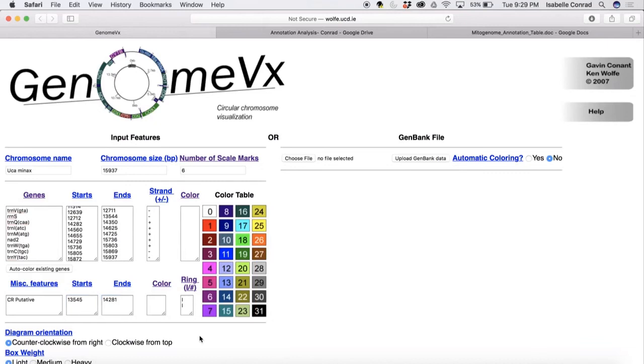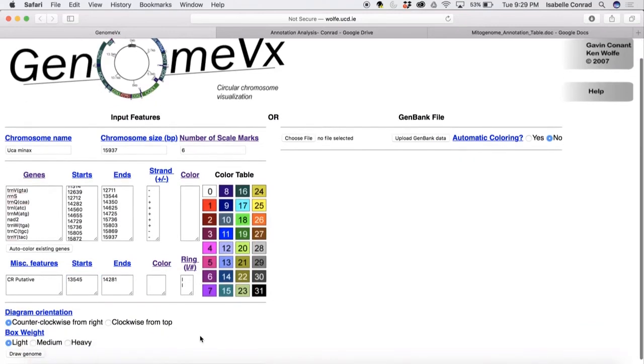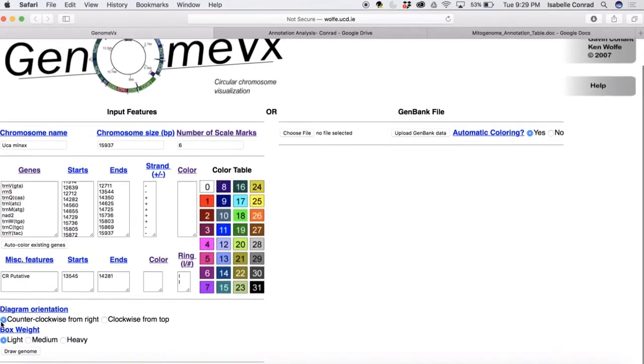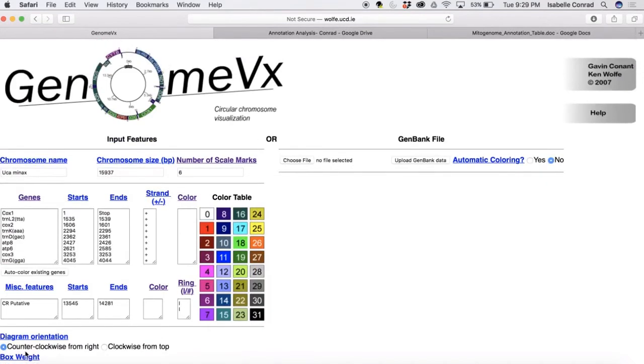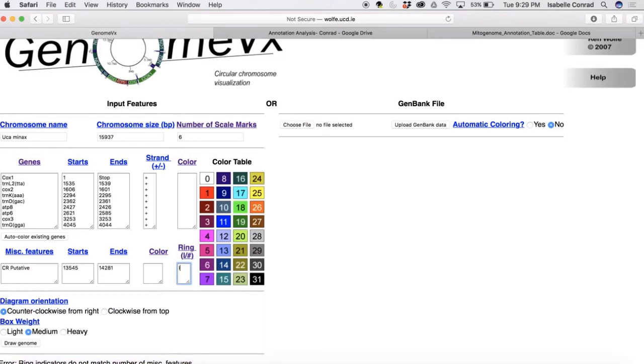So now we are ready to go ahead and create the visualization. So I'm just going to click medium box weight just to see what that looks like and click draw genome. But it doesn't work. So if you'll notice, this website will show you an error at the bottom. It'll tell you what you've done wrong if something is wrong and what you've put in there. So it's just telling me that I forgot to delete this character under the miscellaneous features section.